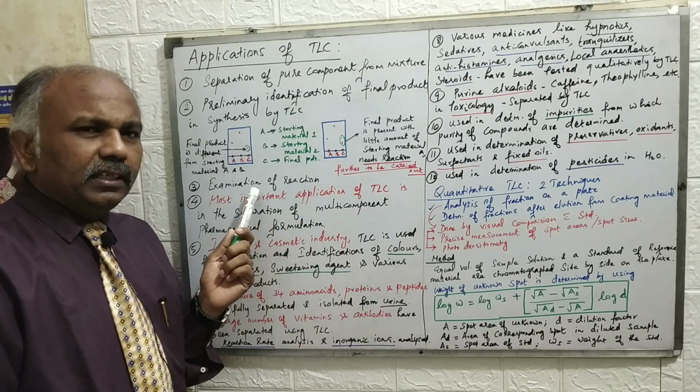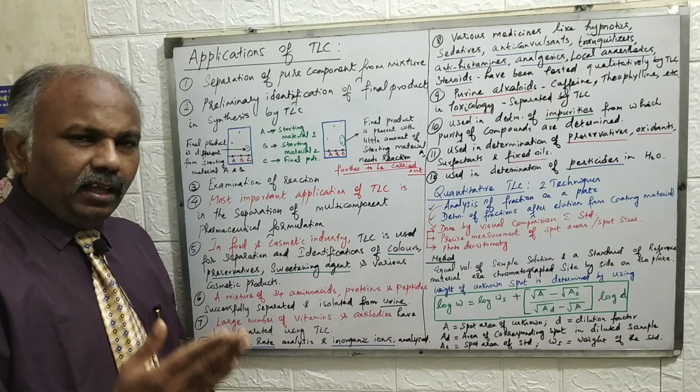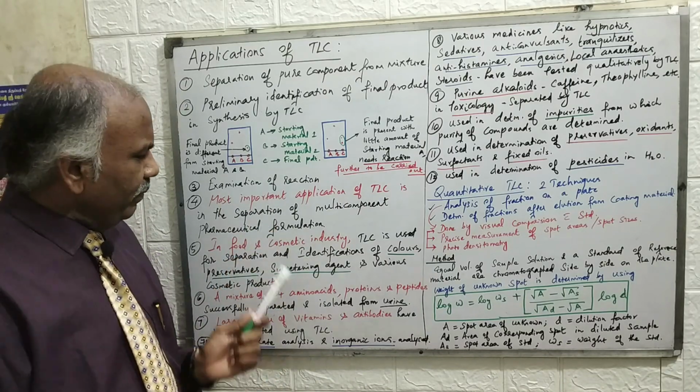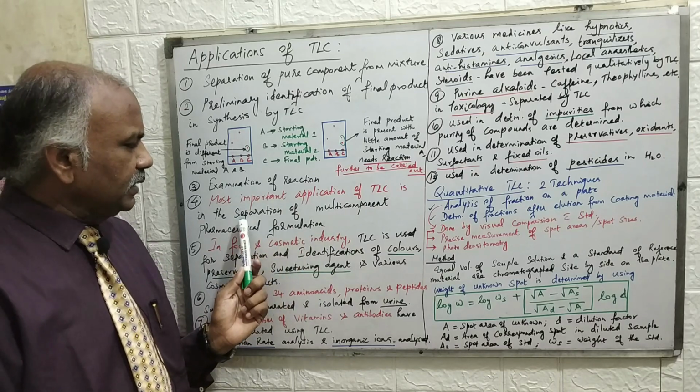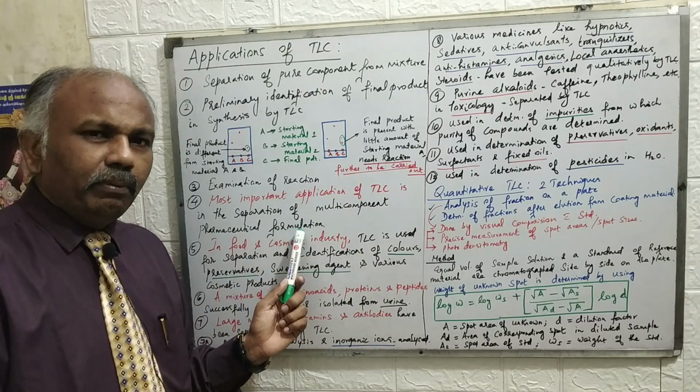The third important application is the examination of the reaction, whether the reaction is completed, started, or yet to complete; all these things we can identify. The most important application of TLC is the separation of multi-component pharmaceutical formulations. This is one of the very important aspects, right?